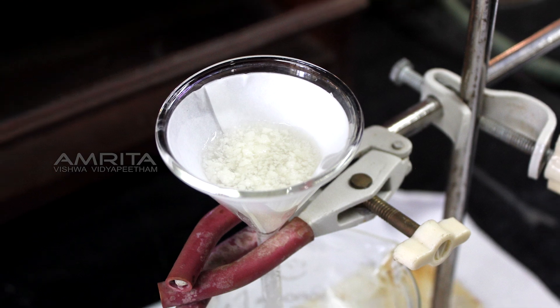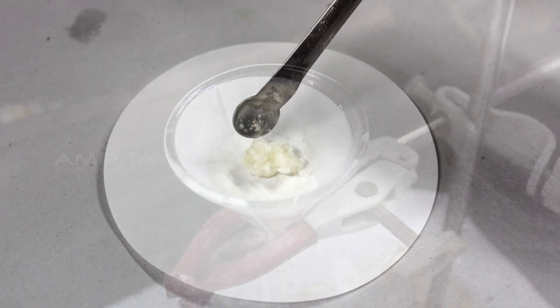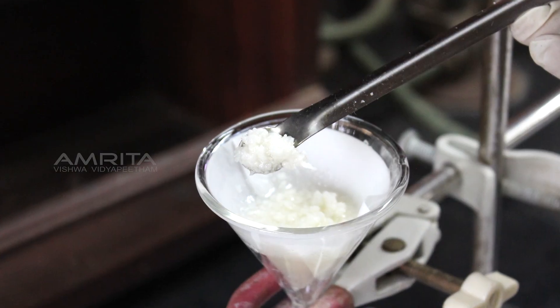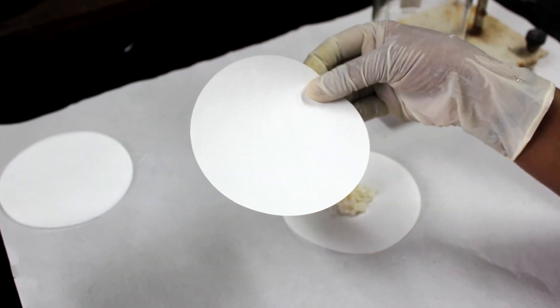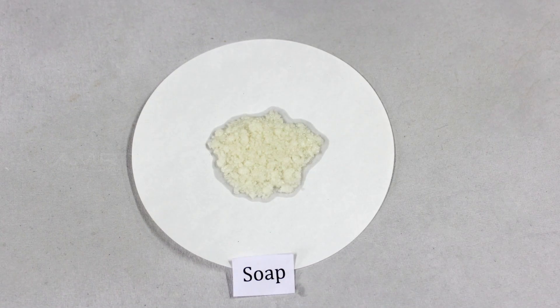After filtration, soap is left behind in the filter paper. Transfer the soap into another filter paper using a spatula. Then dry it by pressing with another filter paper. Soap is prepared.